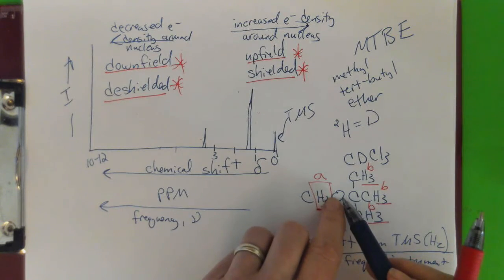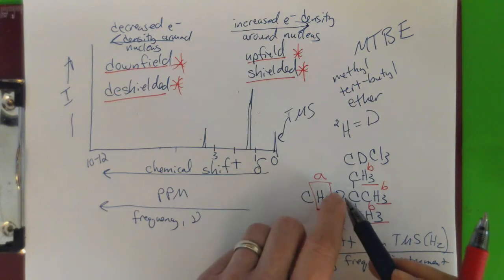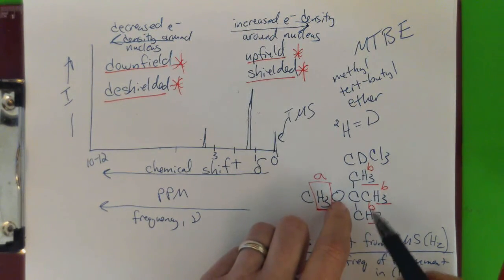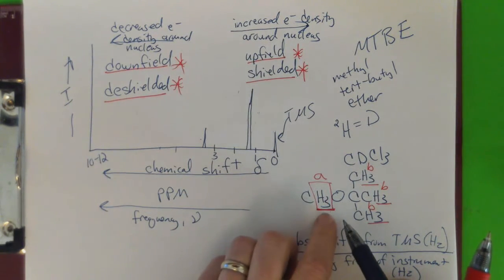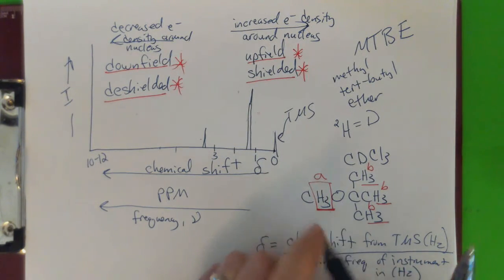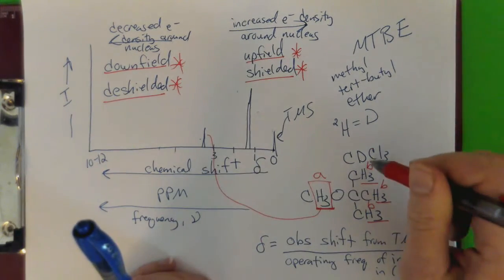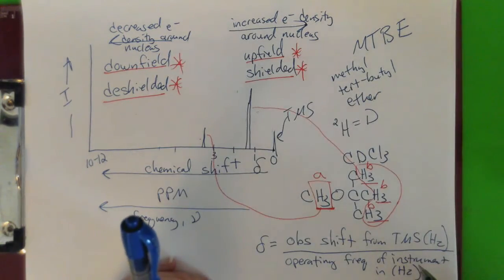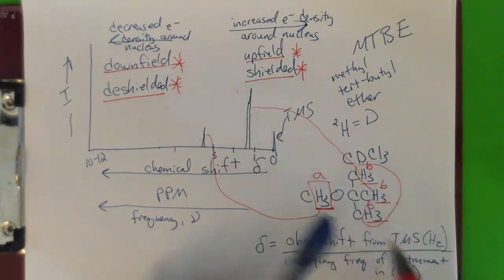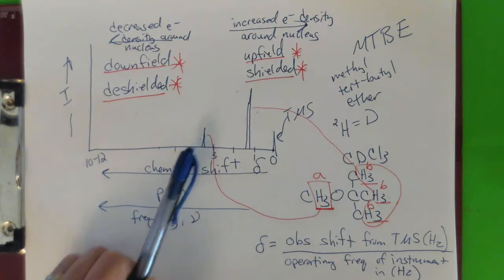And you might say, well, the oxygen is attached to this carbon, which is attached here, and then you've got your hydrogens, but that's farther away. So this oxygen that's very electron withdrawing is farther away from these hydrogens than it is from these. So these protons, their signal should be the most downfield, the most de-shielded, okay? And that's in fact what we see. So they are making this signal here, and then these protons here are producing this signal here, okay? And because we have 3, 6, 9 of these, we have a more intense signal than we do here, okay?